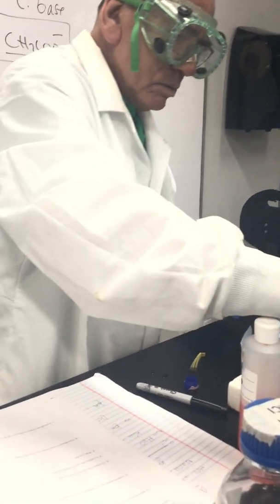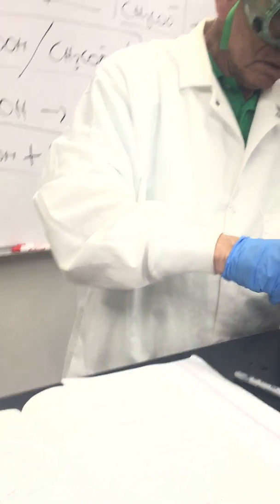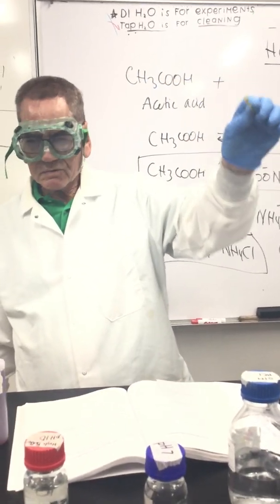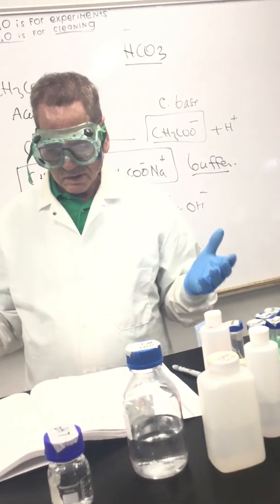So we did 3 different systems to measure the pH. One was the cabbage color, which we made. Two, the pH paper, that gives you a color from pH 1 to pH 14, and then the pH meter, which is digital, you just read it.